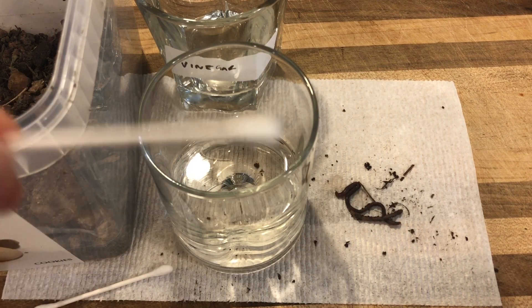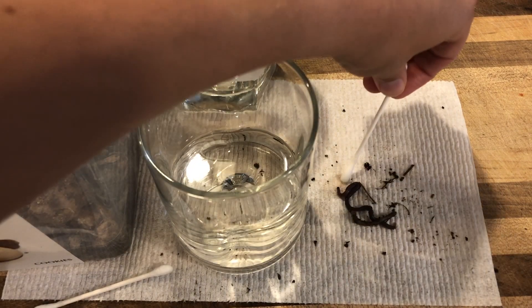Now if you have a Q-tip, take your Q-tip, moisten it with water, and draw a line near your worm.